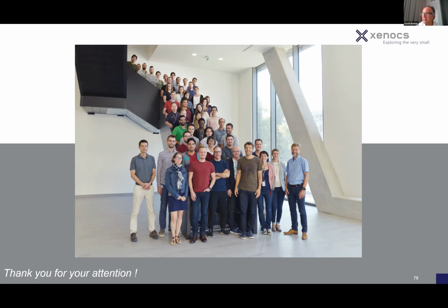I'll give you a hint. The origin of this question may come, if Emma was going to ask. We teach a short class on structure and scattering where we introduce the students to DLS, and they do some measurements, and then they actually do that on the small angle X-ray system as well, and then they try to use fits to extract information about particle size. And so I think sort of your perspective on the two techniques, and if you were to compare and contrast them. Yeah, it's a really relevant question.